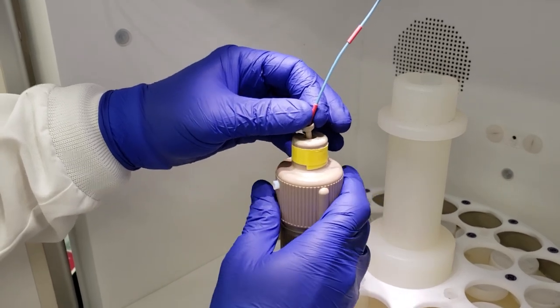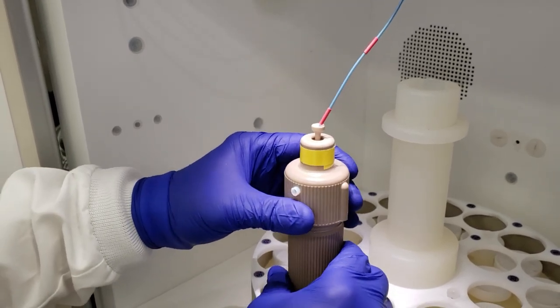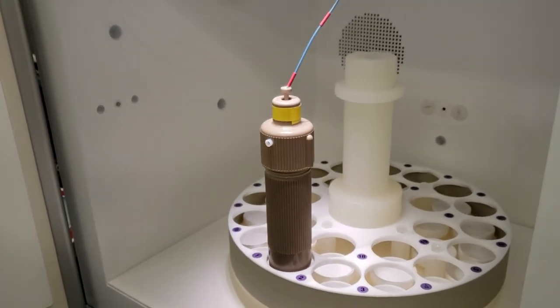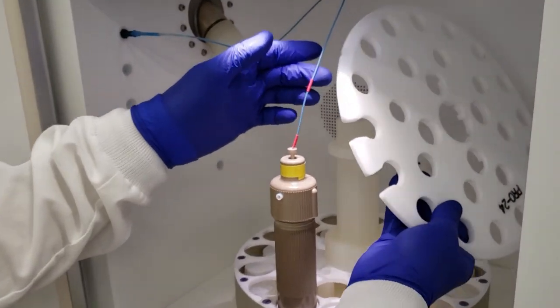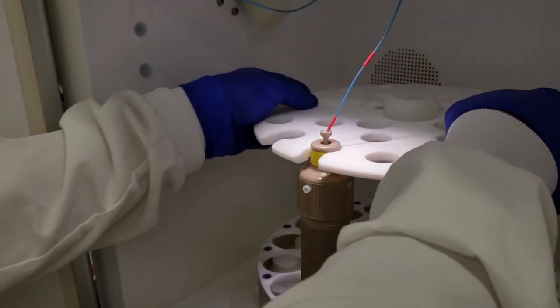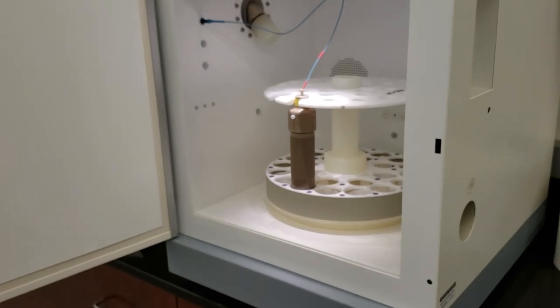Okay, once we've tightened that down, I'm going to go ahead and press that fiber optic into place so that it won't move. Make sure we're tightly sealed. We always aim our vent hole towards the outside of our carousel, so we'll vent to the outside of our instrument. And now I'm going to take the final piece of our rotor, set it in place. This is going to make sure that our vessel remains upright during the course of the reaction. All right, so everything is in place and ready for us to begin the reflux.